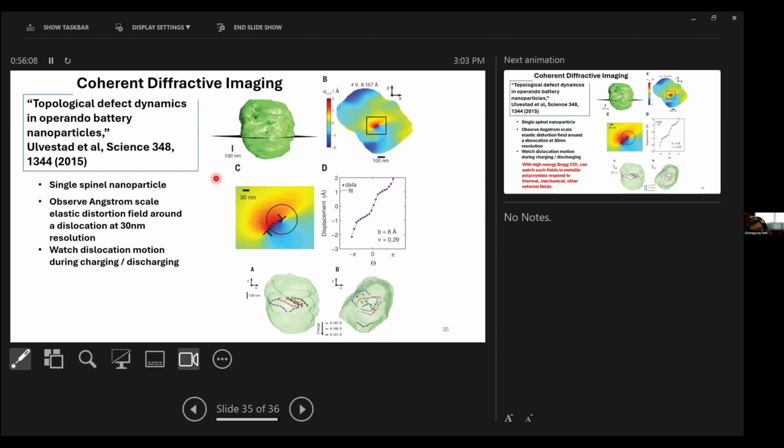Yeah, this method is great and known, but one of the challenges that we face in high pressure science, like samples in diamond anvil cells, is that our grains typically have sub-micron size to a few microns. Sometimes this approach, as you described in the first few slides, has the basic principles of near field imaging and far field imaging, and has a sensitivity to the distance and position and size of the grain and so forth.